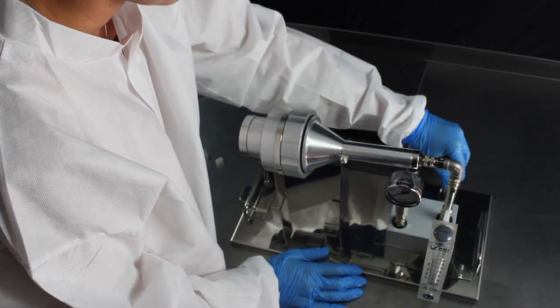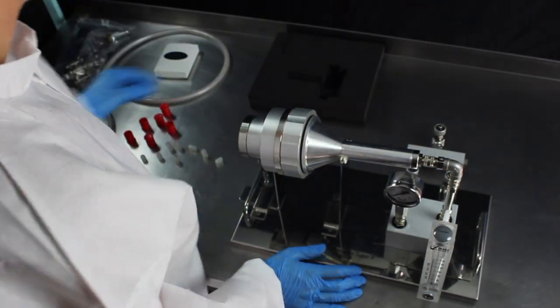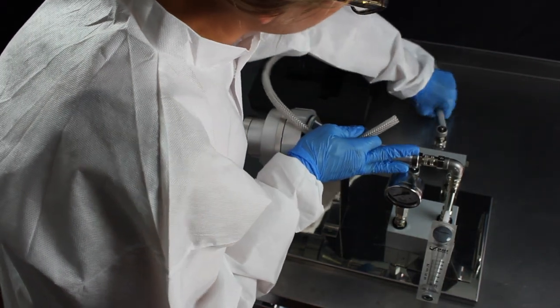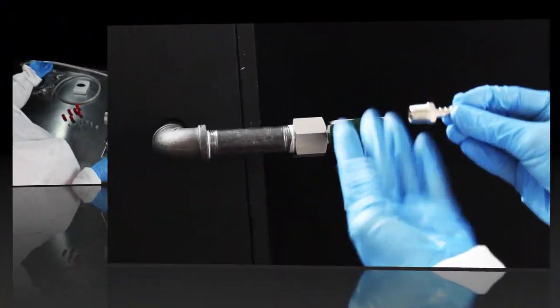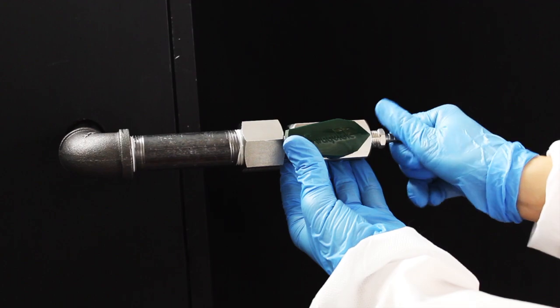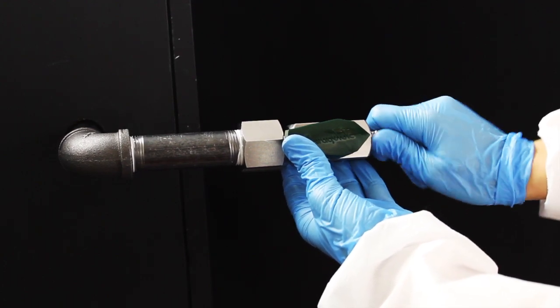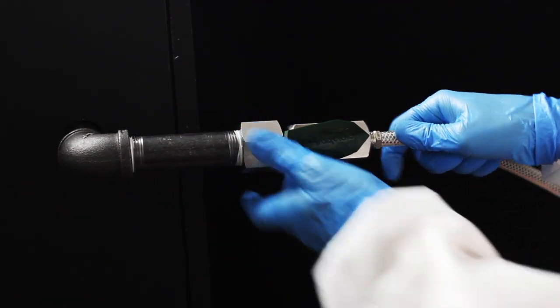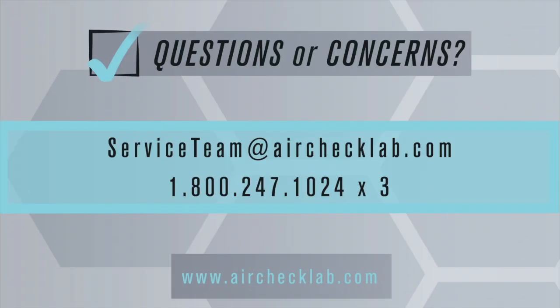With the control valves closed, connect one end of the sterilized 3-foot braided tubing provided to the air inlet connection barb found on the Pinocchio and the other end to your air or gas line. Use the clamps and nut driver from the accessories bag for a more secure fit. You're now ready to begin sampling.